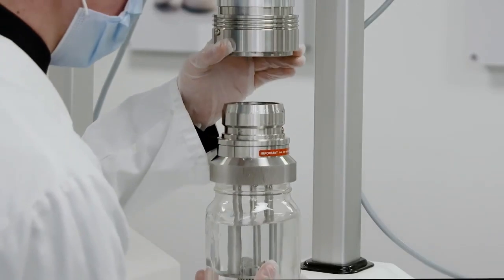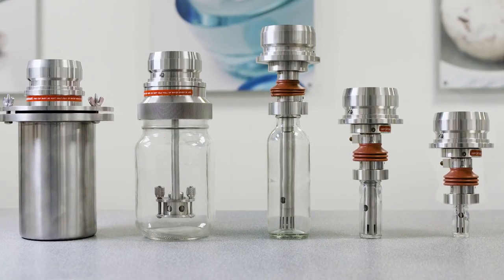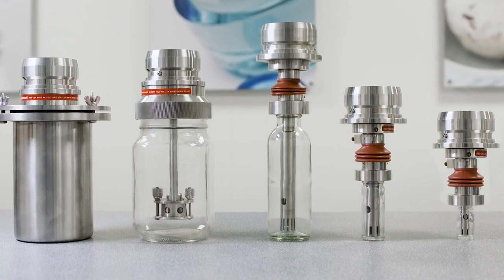It features a quick-release mechanism permitting use with a range of mixing assemblies and containers, including stainless steel vessels and glass vessels, from 7 milliliters to 1 liter.